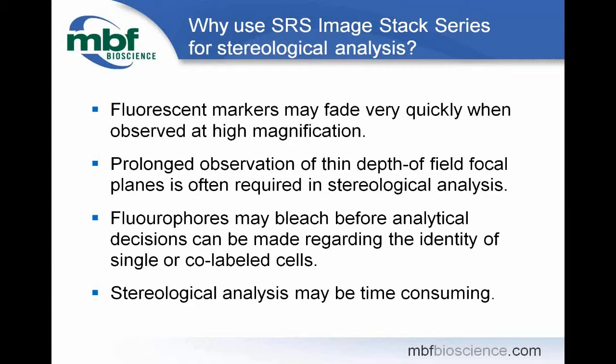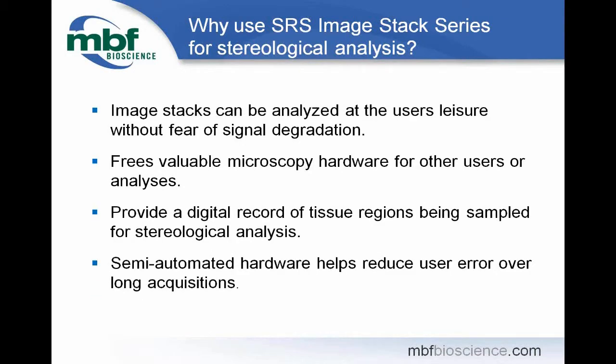Many commonly used fluorophores may bleach quickly, before analytical decisions can be made regarding the identity of single or co-labeled cells. And non-trivially, stereological analysis may in fact be time-consuming, making it difficult for labs to share microscopy resources efficiently. Image stacks, on the other hand, can be analyzed at the user's leisure without fear of signal degradation.